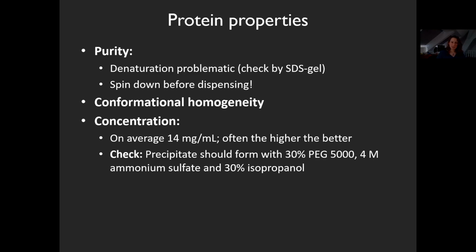You have conformational homogeneity. This is something that you want. You want stuff that is not too floppy, but you can't do very much about it. It may be conformationally heterogeneous. If so, you may want to lower this.